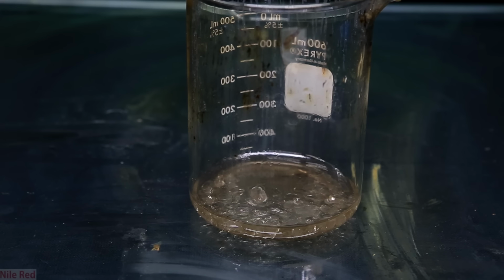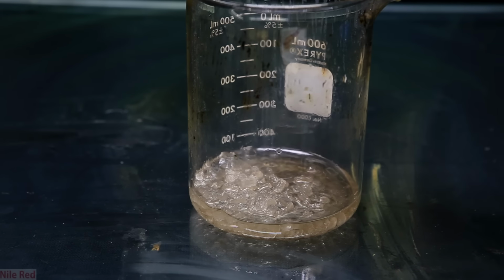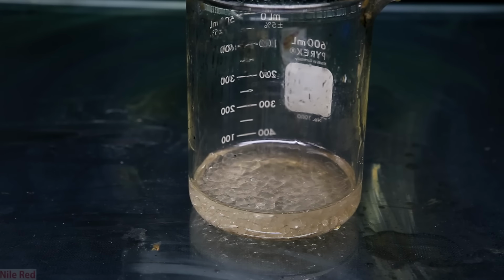Now, a little bit of some extra stuff that turned out to be pretty interesting. To clean out the iodine, I use a crazy excess of sodium thiosulfate. I stated earlier that iodine is really insoluble in water, so this poses a little bit of a problem for cleaning. We could in theory do like we did at the beginning of the video and react it with some sodium hydroxide, but I find that using something like sodium thiosulfate, which is much more mild, is more to my taste.